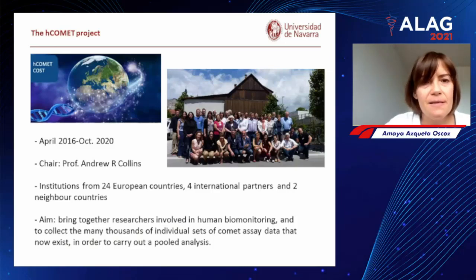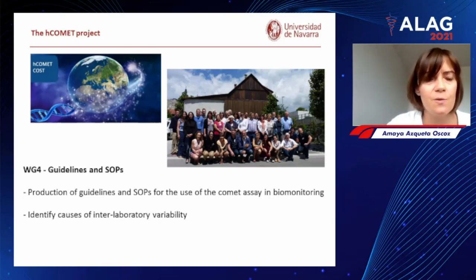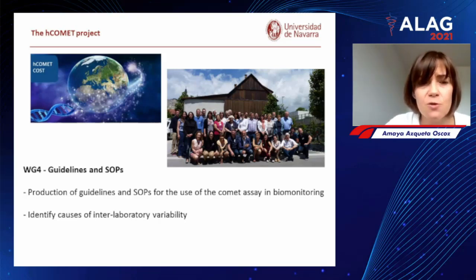Well, I think I'm going to skip this slide because Mirta has already explained the hCOMET project. I just want to say that I was the lead of working group 4, the one dealing with protocols. The objectives of this working group were the production of guidelines and standard operating procedures for the use of the Comet assay in biomonitoring, and also to identify causes of interlaboratory variability. The Comet assay has quite high interlaboratory variability, and we have made a lot of efforts to detect the causes of this variability and also to decrease it.